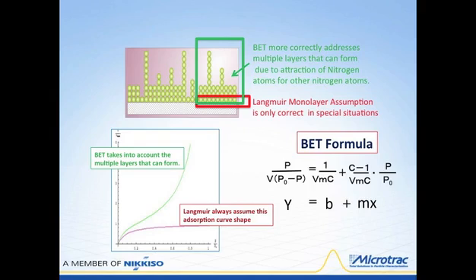Down here at the bottom, Langmuir assumes this type of adsorption occurring, which is not, in fact, the best science that can be applied. In some cases, Langmuir adsorption can be applied for chemisorption. In actuality, what is probably happening is something like this, and this is why the BET became very important, because it took into account the fact that molecules can layer themselves. This has to be taken into account because the surface area calculations really should just be including the single monolayer of gases.